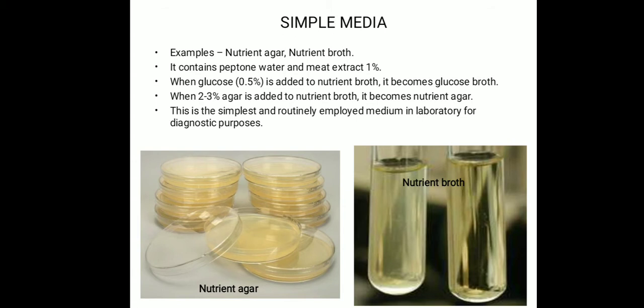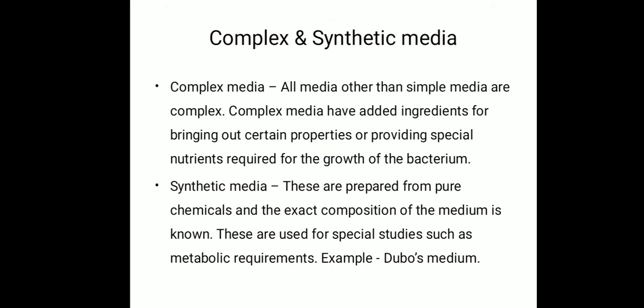Then next we have the complex and synthetic media. These need extra care, as we need to add extra things in this case. The complex media have added ingredients for bringing out certain properties or providing special nutrients required for the growth of the bacterium.